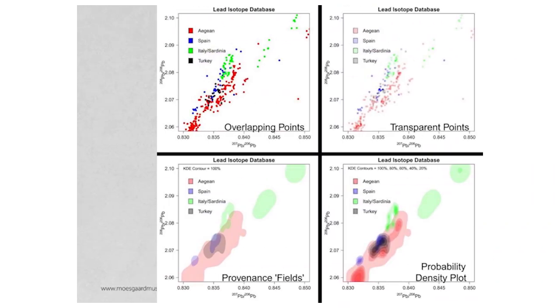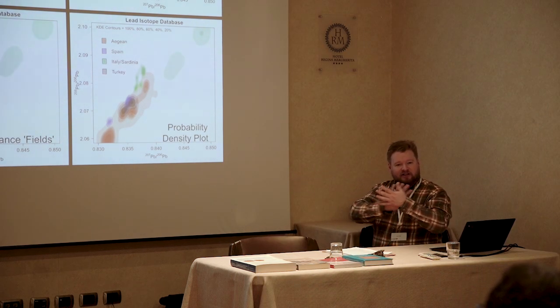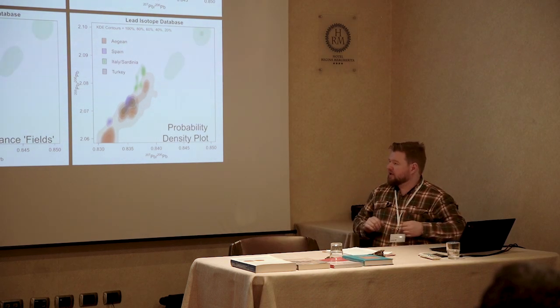So this is a significant development, because now we can really consider this as a source for that period. Some of these issues, essentially, when you get plots of lots of points, people can overlap them, hide things, show things, and it really depends how you choose to show your data, you can manipulate it quite significantly. One of the things I was pushing towards was having everything transparent, so you can show everything on the same plane.